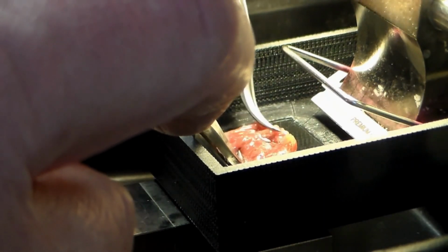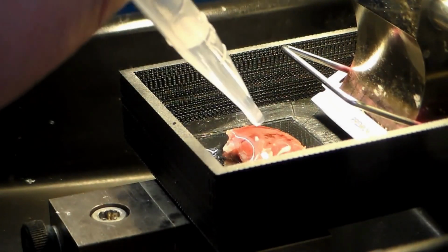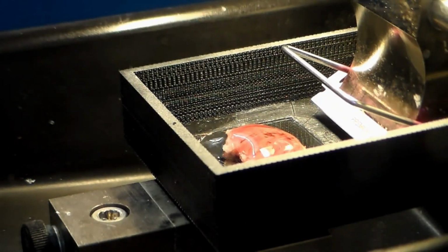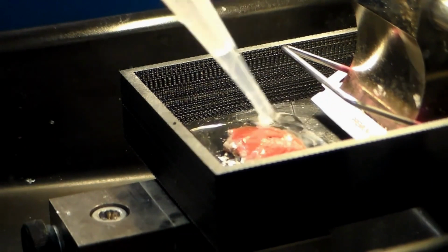This particular adhesive is very quick acting, and it only takes about 30 to 60 seconds of holding the tissue to the adhesive, and it will adhere. And as quickly as you can, you would then put the relaxing solution onto the left ventricle.